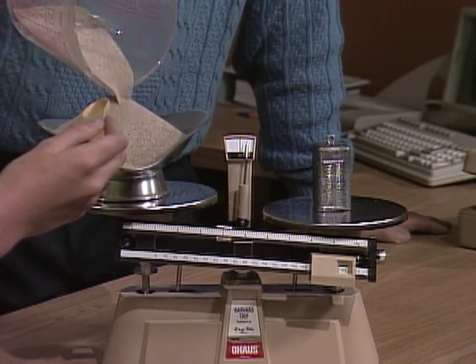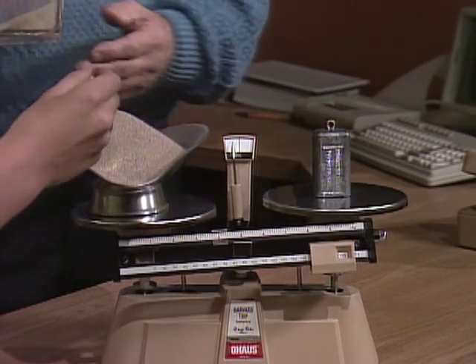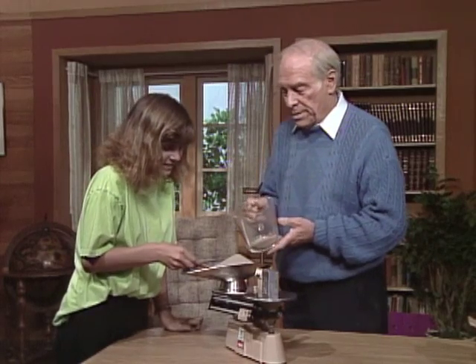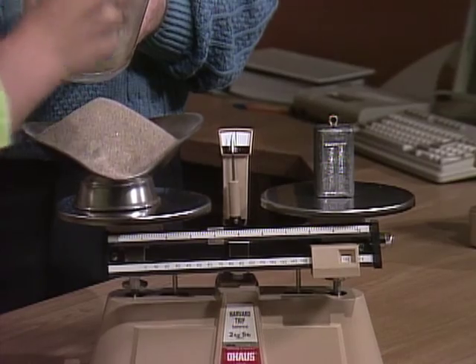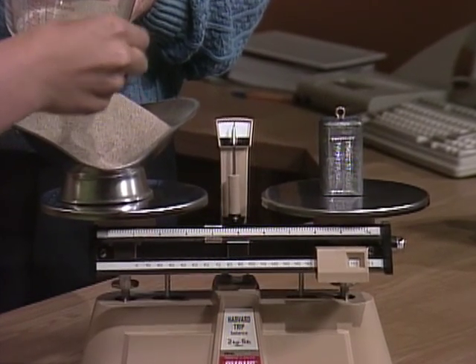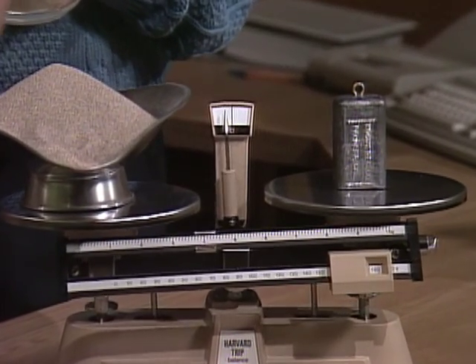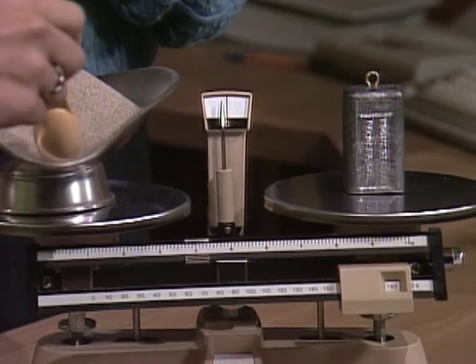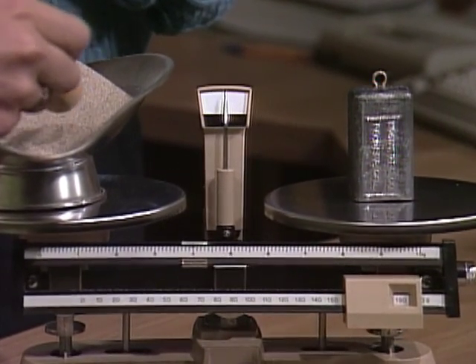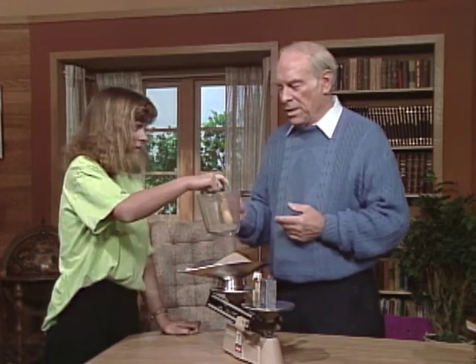We're also going to assume that's a very expensive chemical and we want to be sure we have exactly one kilogram. That's too much — have you done this in school, worked with a double pan balance like this? Okay, so you know what to do. It's a little heavy yet. Let's assume that's good enough because we're just illustrating a very important concept.